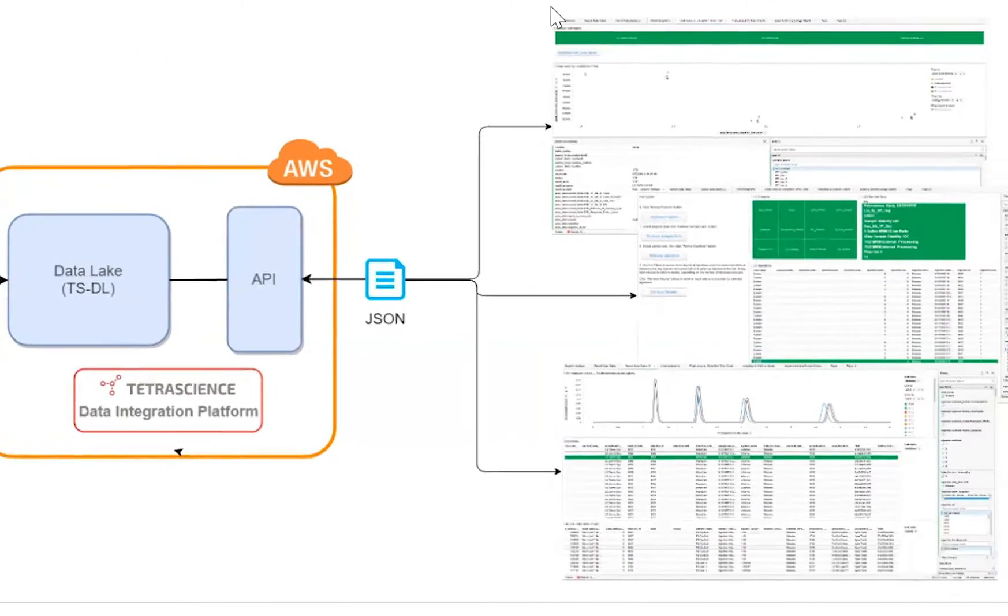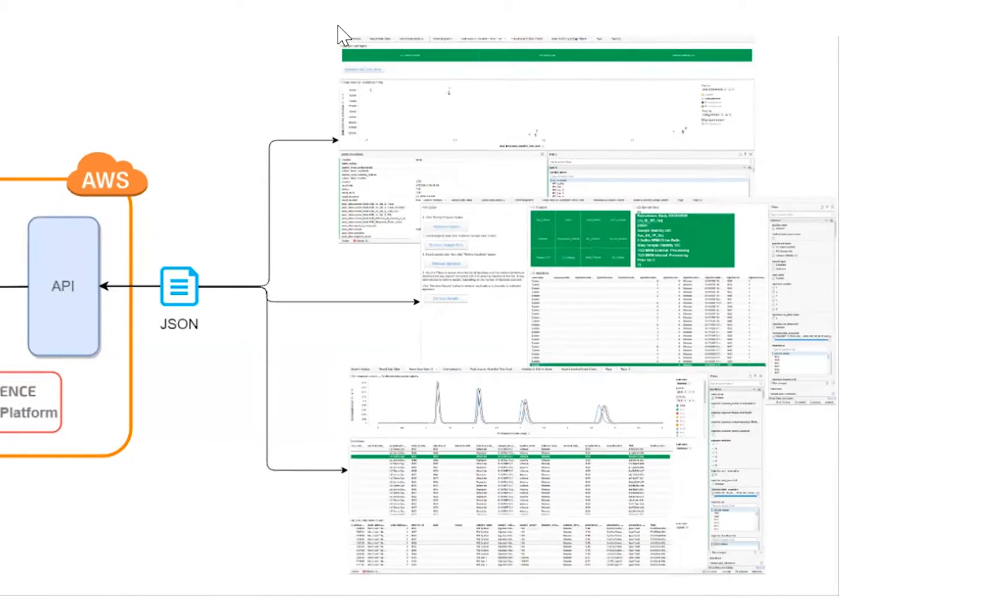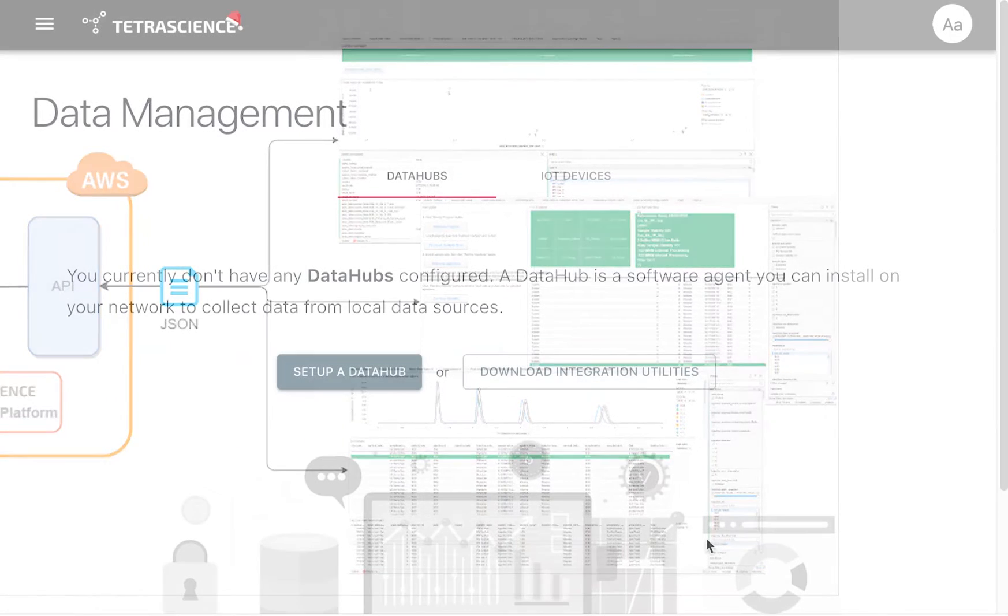And finally, we'll see visualizations of our Empower chromatography data that were generated across multiple instruments and sites. So let's jump right in.